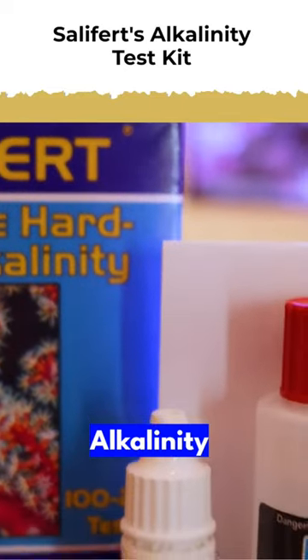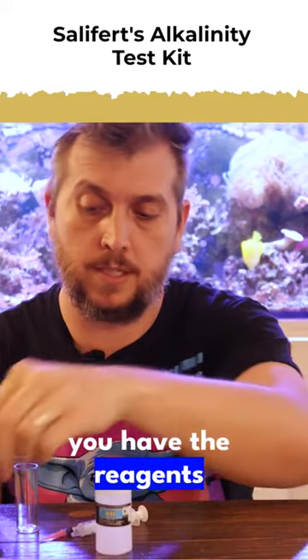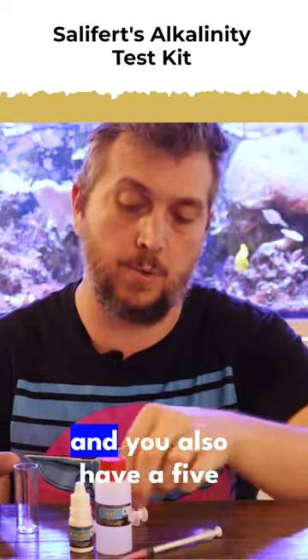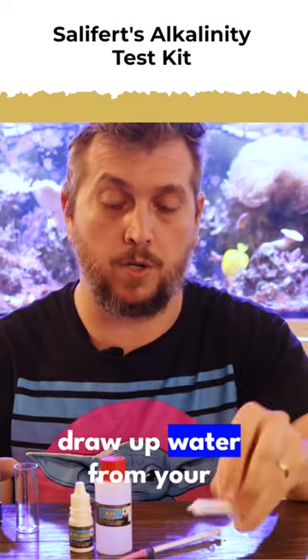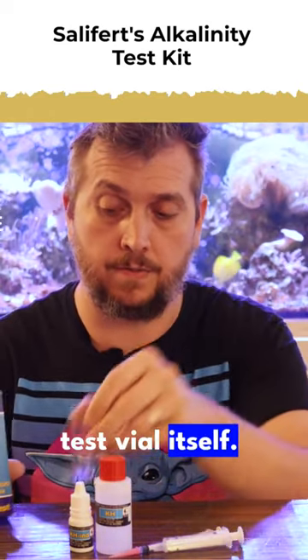Salifert's alkalinity test kit. Right out of the box you have the reagents for the test, you have the syringe, and you also have a five milliliter syringe to draw up water from your aquarium, and then you have the test vial itself.